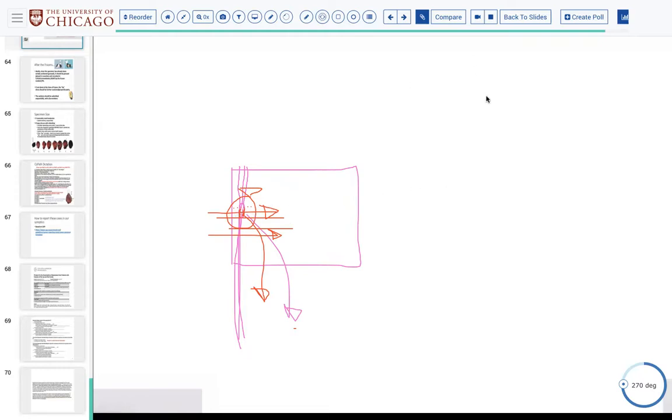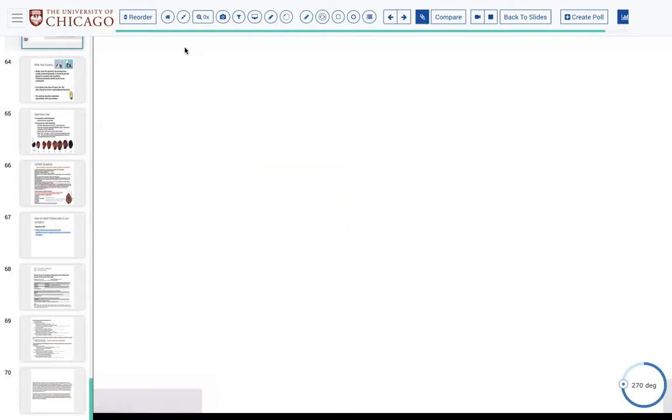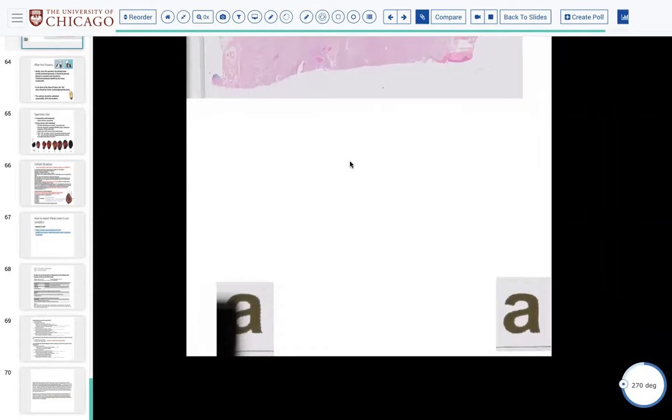And can we ask, for these small vocal cord tissues, to use colorful OCT instead of the clear ones, because the clear ones make it more difficult to see? Sure. I mean, if you're coming up on a clear and you don't want to use the clear, just ask them to swap it out. That's not a problem. We have multiple colors and only one type of clear, right? So yeah, for sure.